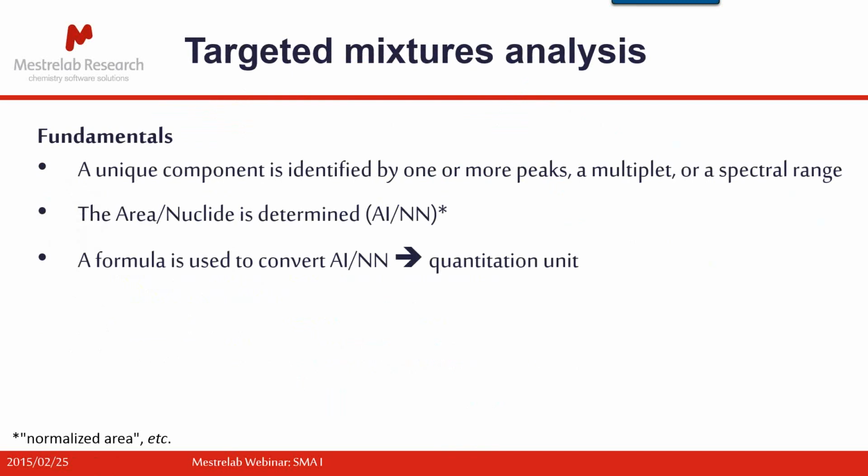So what's going on here when we're doing targeted analysis? The fundamentals are that we really need to identify a unique component based on one or more peaks, a multiplet or spectral range in the mixture spectrum. That's really the heart of it.